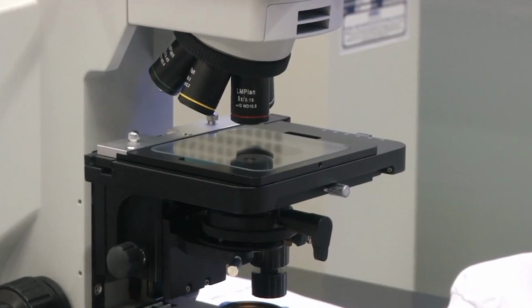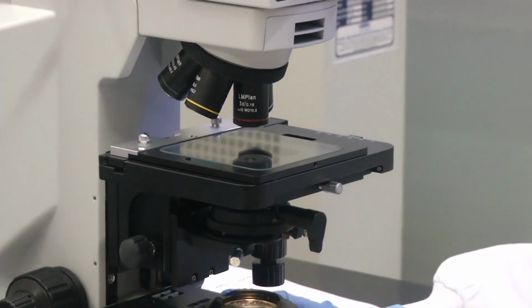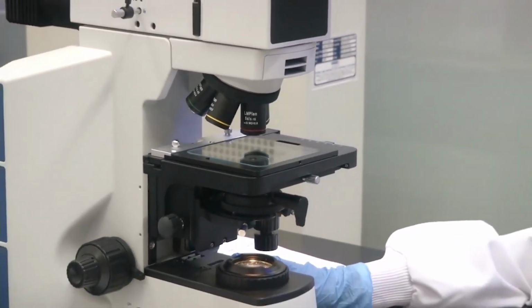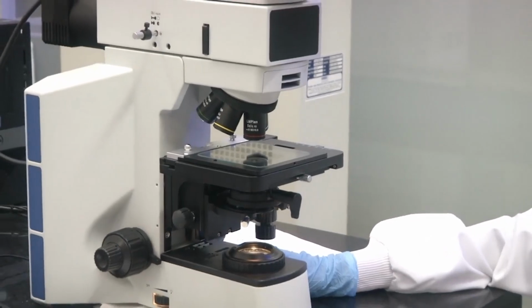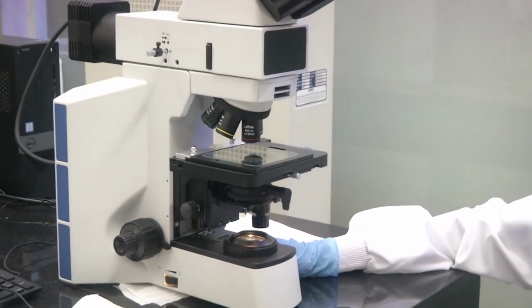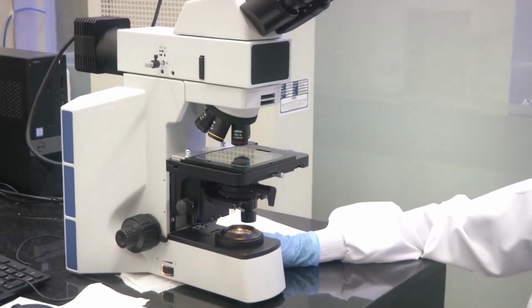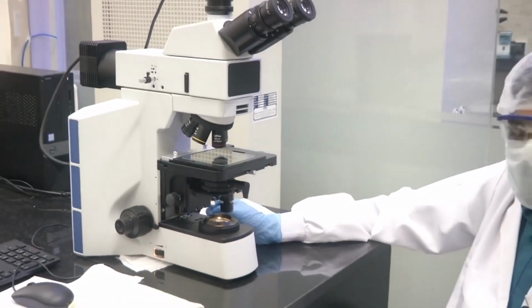Now, why are they important? When we saw the stereo microscope, the illumination was coming from the top. So what would happen in the stereo microscope? The light coming from the top falls on the sample, gets reflected, and is picked up by the eyepiece. But in this microscope you have both options.